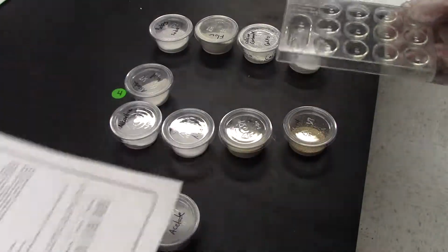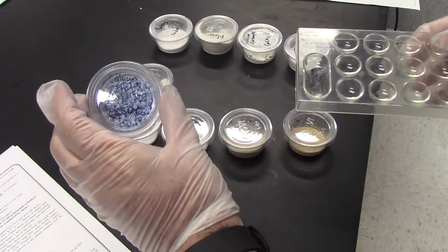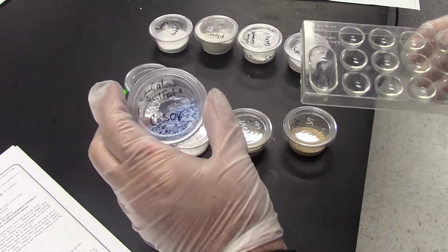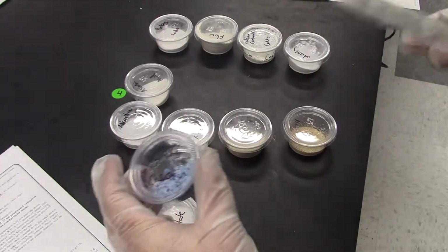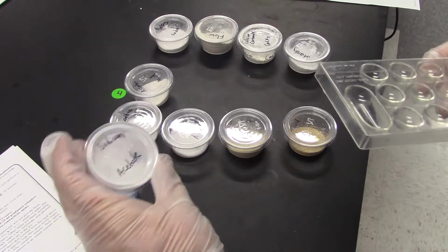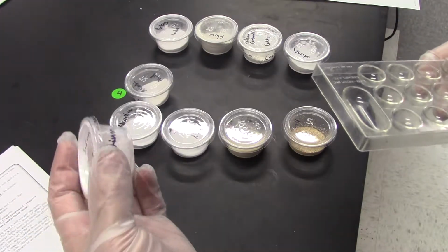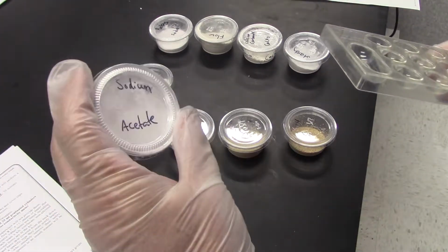If you're coming in and practicing this, for example, this is calcium sulfate, I would make a table that has basic properties. The first one is, what does it look like? Here we have blue crystals. Then sodium acetate, which is pretty much dried vinegar. This is what you could mix with water in order to make vinegar.